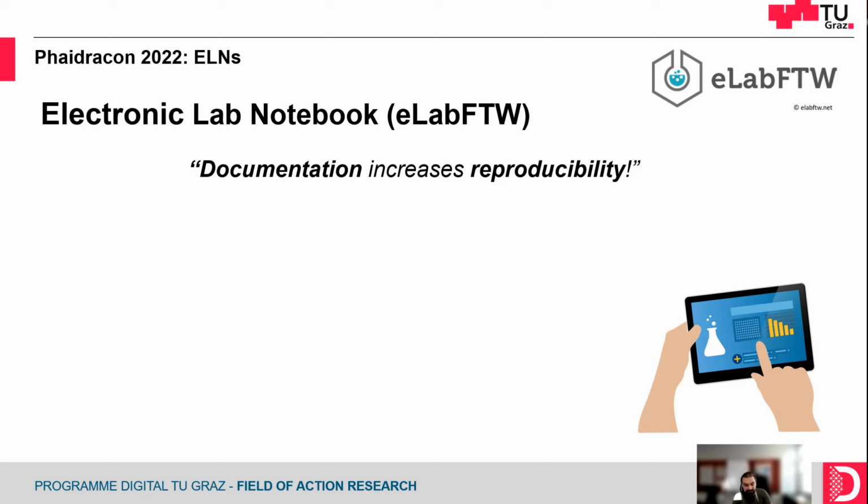I think what every ELN has in common is that documentation increases reproducibility. As we mentioned before, metadata is somewhere the documentation, and documentation is absolutely necessary to reuse data and, of course, for reproducibility reasons.